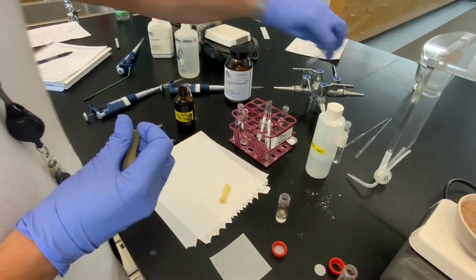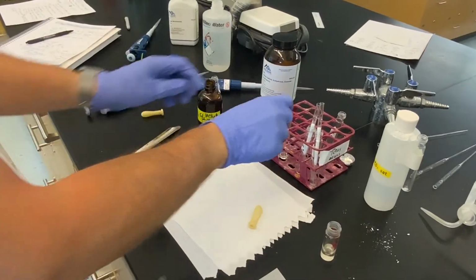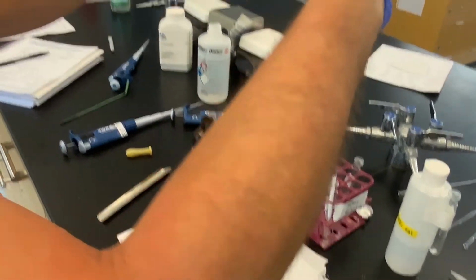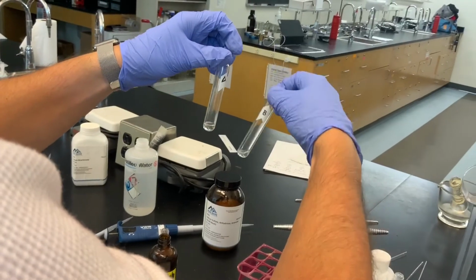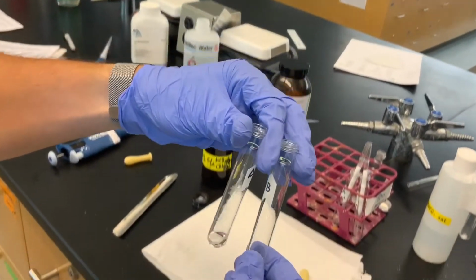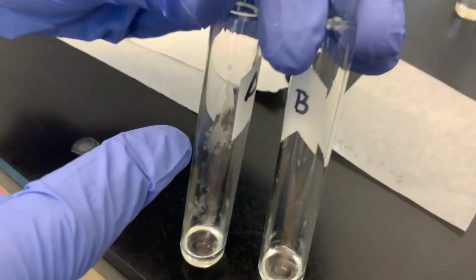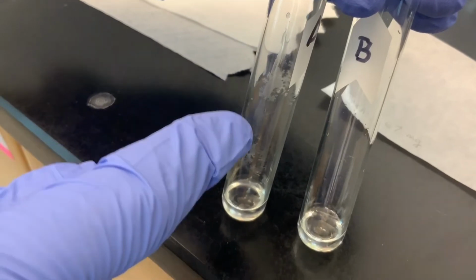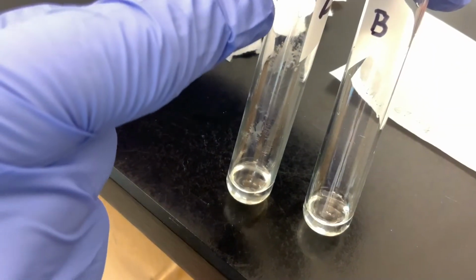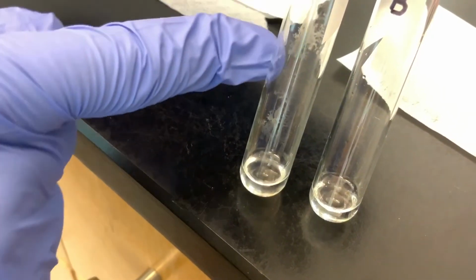Okay, so now we need to dry both of these organic layers with anhydrous sodium sulfate. Look closely at culture tube A: this residue here, that's benzoic acid, from just adding in the methylene chloride, it evaporated and then left its residue.